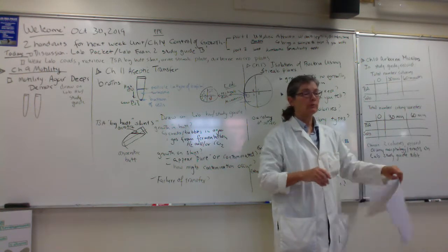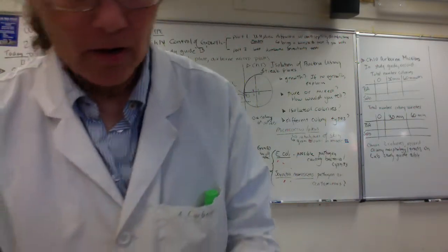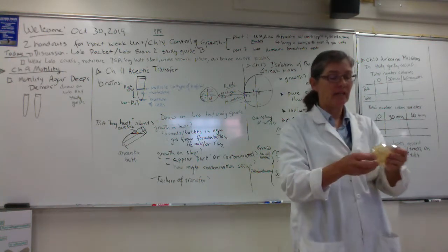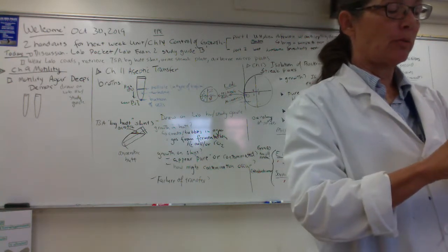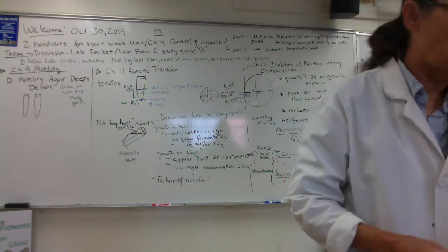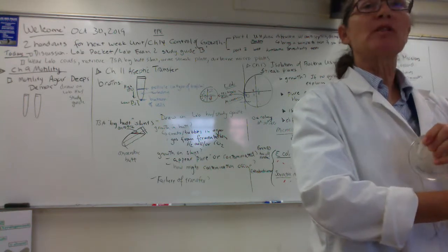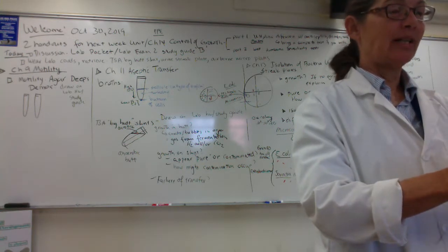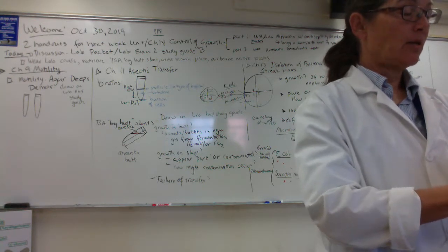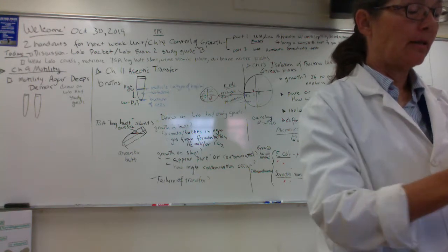Okay, folks, so first of all, let me give you the results on our airborne plates. What are the 0-minute plates? Why did we do 0-minute exposure plates? Those are negative controls, right? Because you guys, we need to make sure that the agar in the plates was sterile, right? If it was already contaminated, the whole experiment is a bust. So we ran the negative controls, you guys, the 0 minutes.